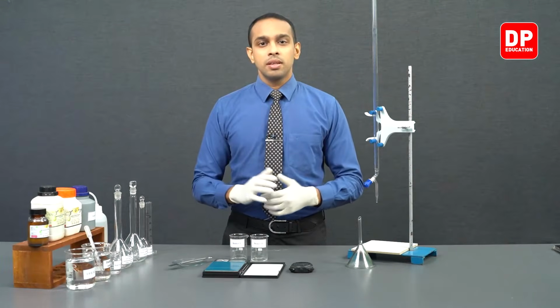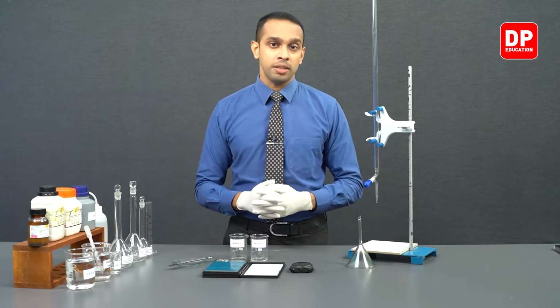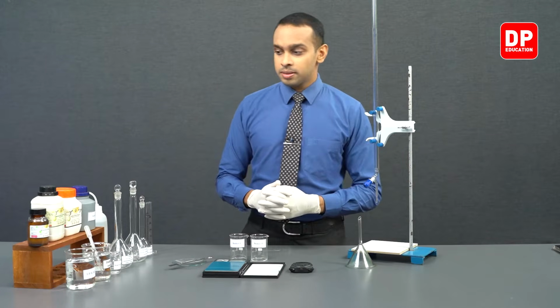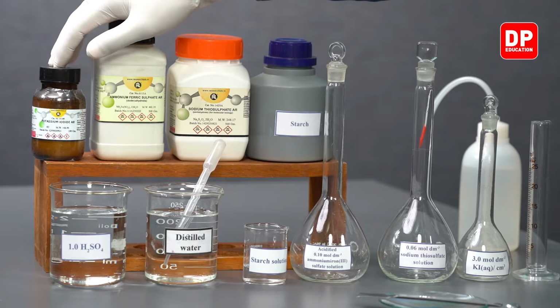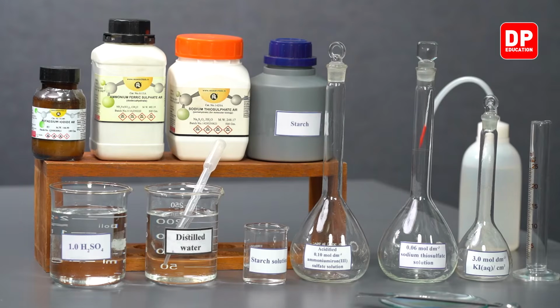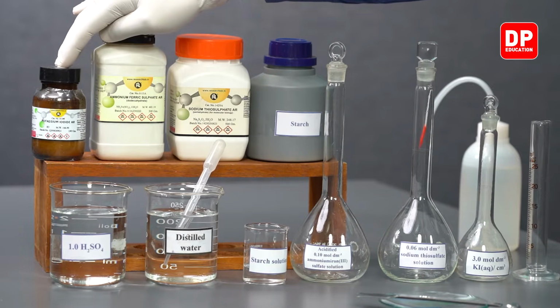Now, let's move on to identifying the chemicals and the equipment we will be using for this practical. We will be using potassium iodide solid, and we'll be preparing a potassium iodide solution with it.